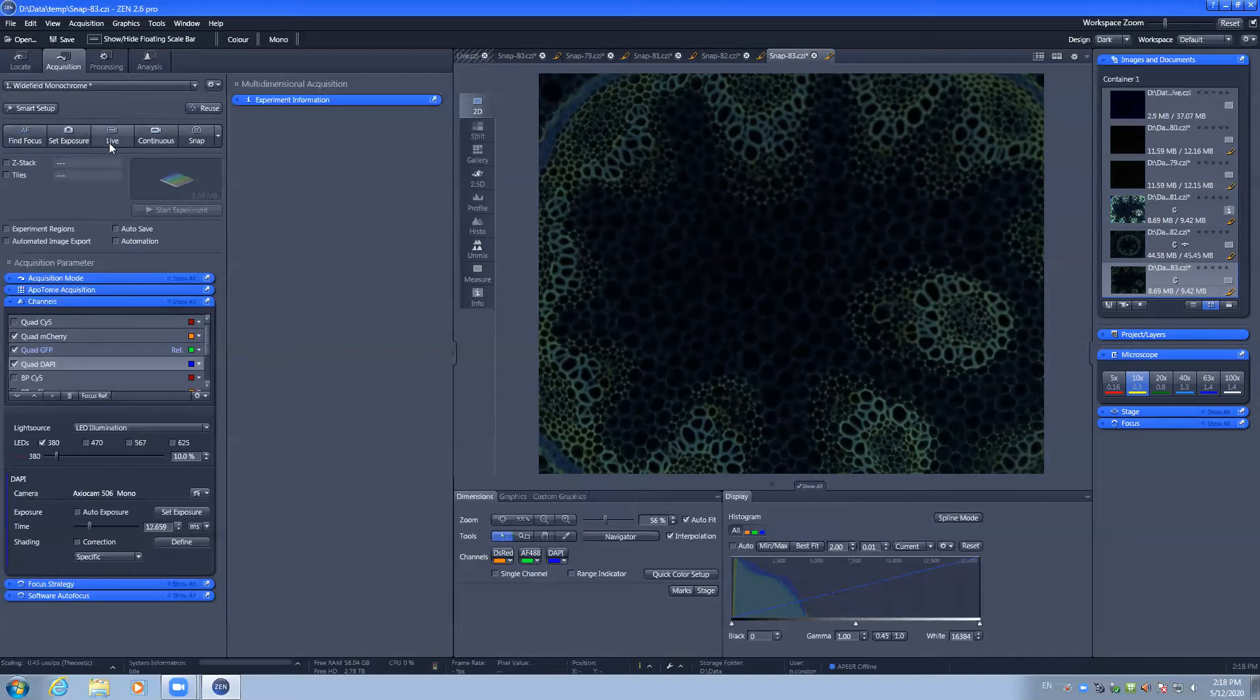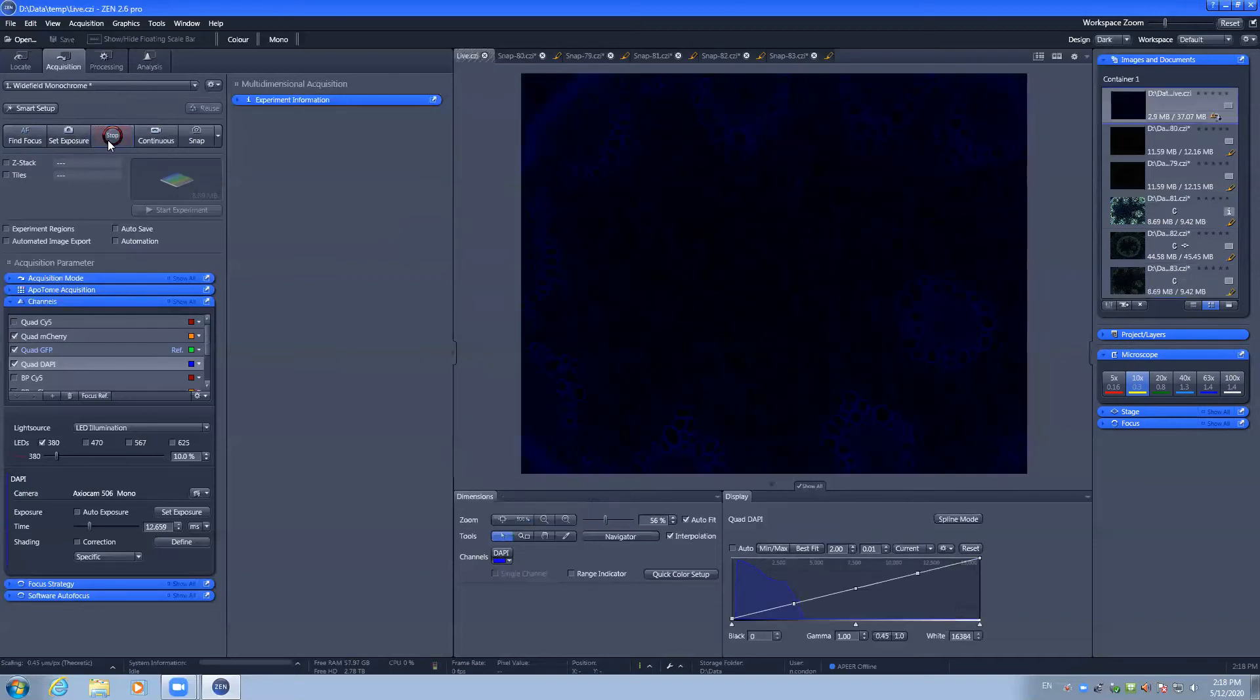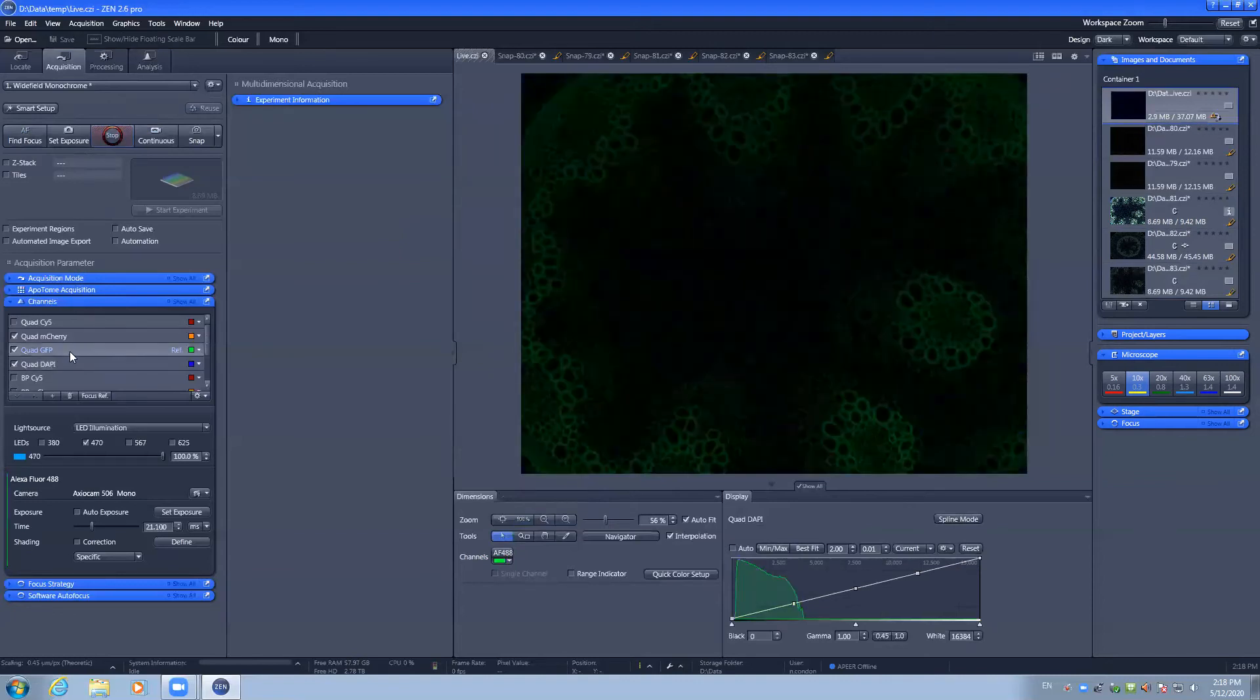To get a live image on the screen, select the live and the channel that you are on will be the active channel that is displayed.